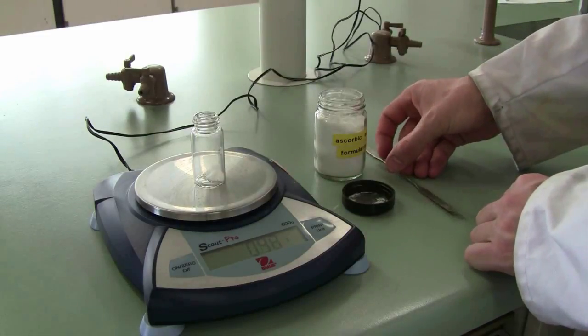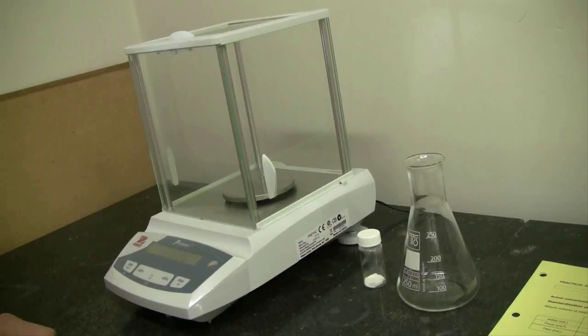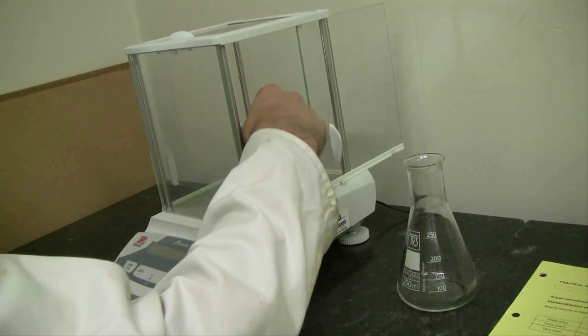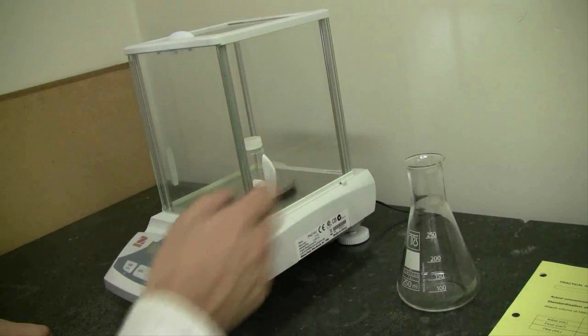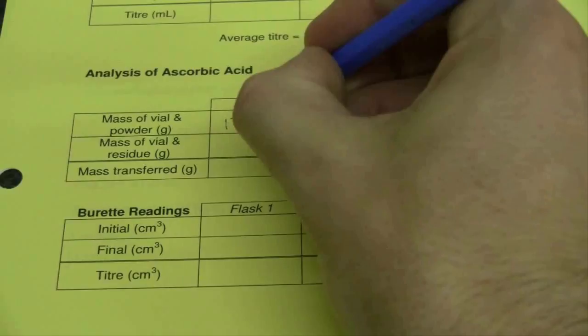Then come into the analytical balance room, and here is where we will determine the true mass of ascorbic acid that you are using for analysis. Zero an analytical balance with the doors shut, and then place your sample vial plus your sample in the balance. Record your mass to four decimal places and note that directly down in your result sheet.